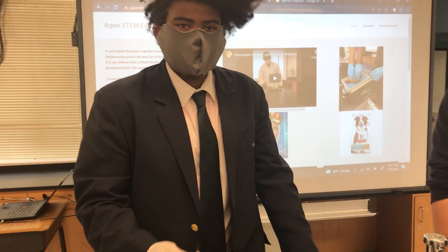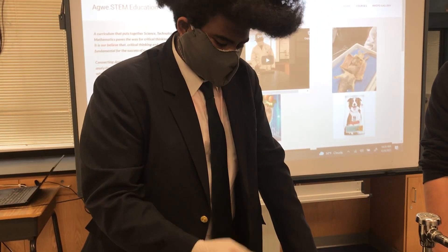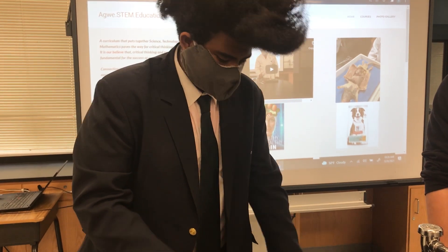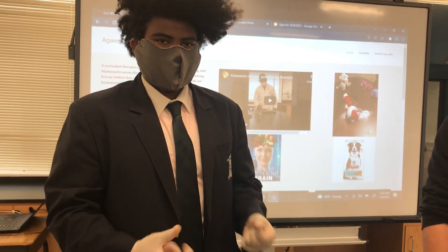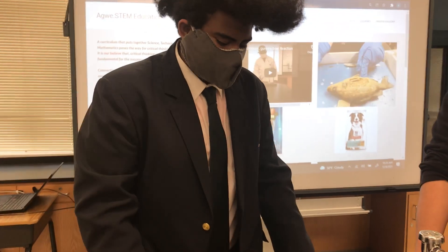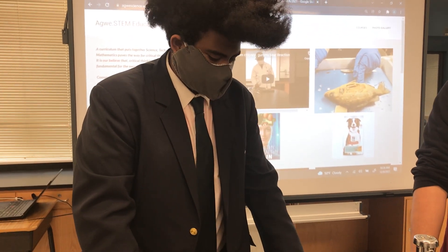We took two scoops of the substance, put it into the water, stirred it, and what that should have done was broke apart the bonds and produced ions. And those ions would allow electrical current to flow.